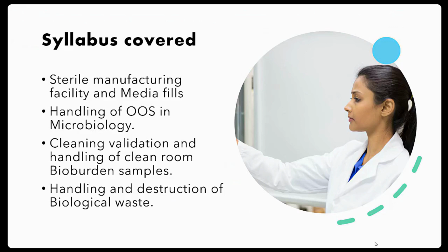Next, handling and destruction of biological waste. We are growing the microorganisms. We are handling the culture media. We are generating so much biological waste in the microbiology laboratory. As you all know, biological waste is very harmful for our environment. How this biological waste can be destroyed, how we'll handle it to avoid cross contamination and to avoid spreading of infections. This is a very critical part, we'll discuss later.